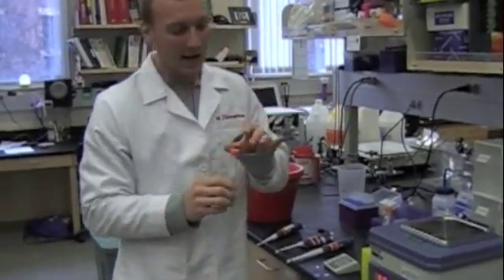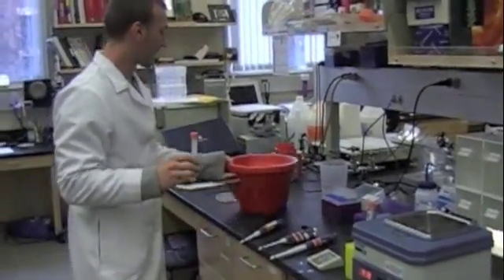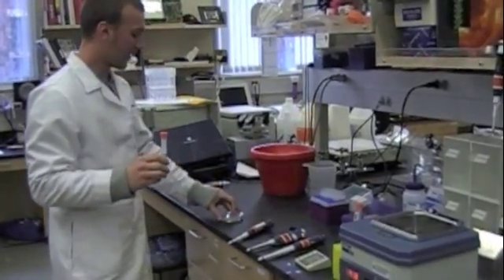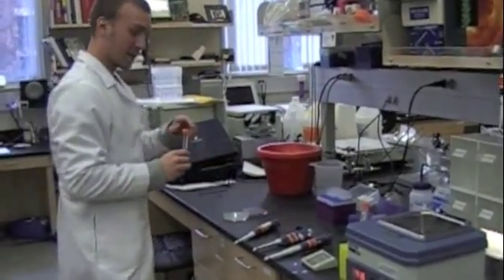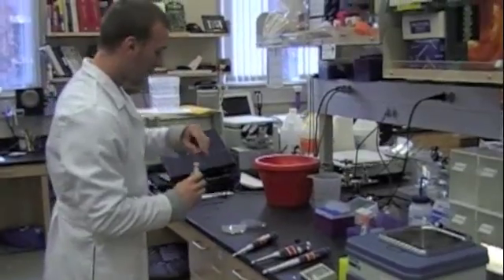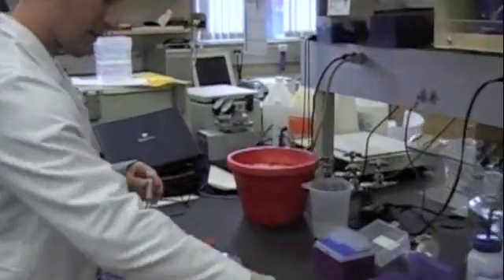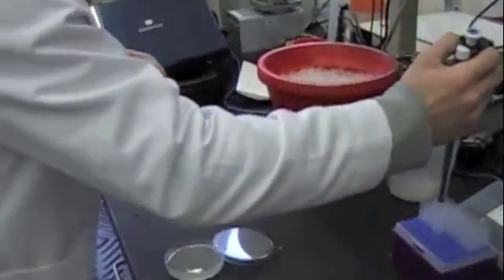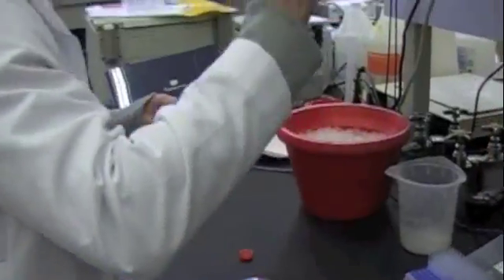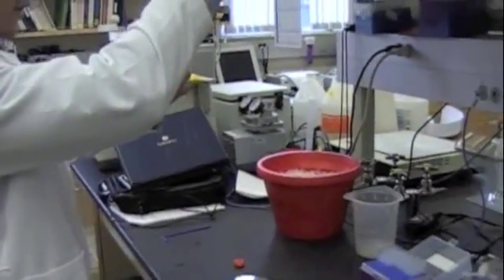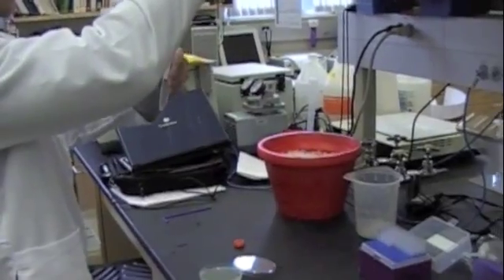we'll take this 50 ml falcon tube and continue to our final step of the transformation where we pipette this mixture onto our selective agar plate. We will take the whole 250 microliter sample and pipette this directly onto the agar plate.